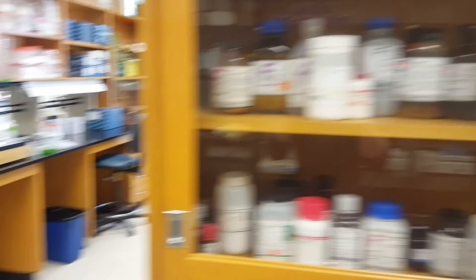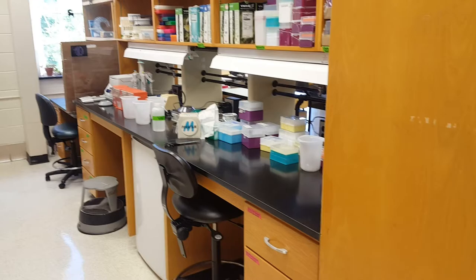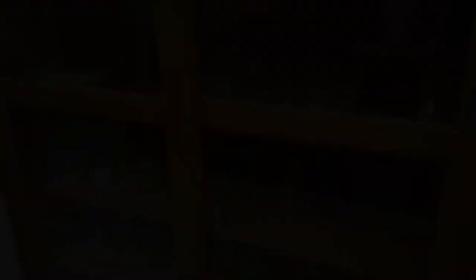Moving on to our next row of lab benches. Over here is where my desk is, and this is also the lab bench that I use for my experiments. We're going to take a closer look at some of the equipment on this bench in just a second. And in this last cabinet is where we store all of our glassware like beakers and flasks.